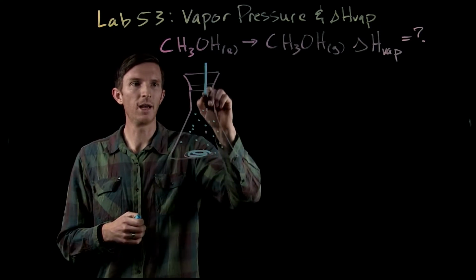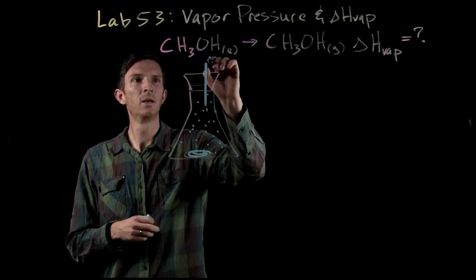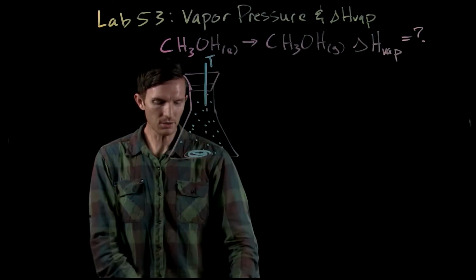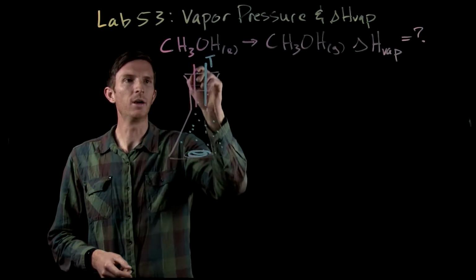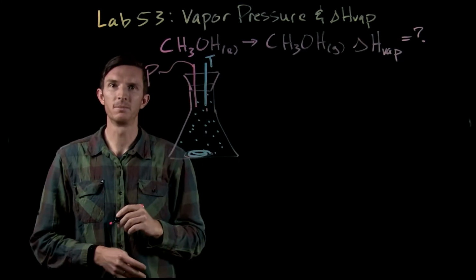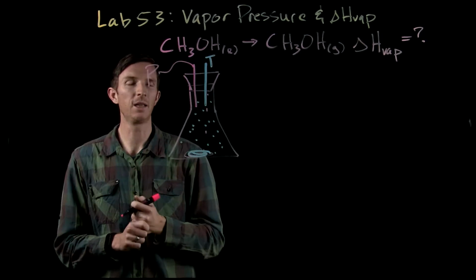And so what we'll do is take a thermometer because we want to measure the temperature, and then we will also have in here something that we can measure the pressure with, okay, because we're going to need those two pieces together.